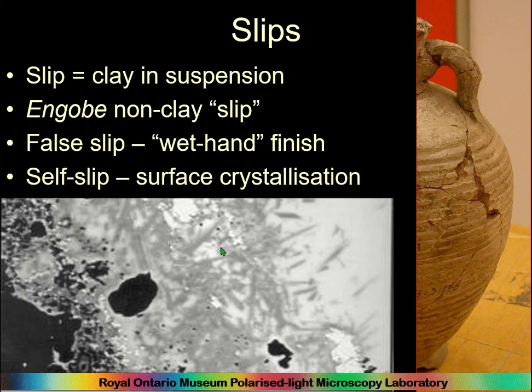And this is an interesting thing. This is an SEM picture. This is the clay body on this side, and this is glaze. And these are crystals of wollastonite, which is a calcium silicate. So it's possible that the grey ones here create a white slip on this pottery. It looks like, because this is a red firing pottery which is white on the surface because of the wollastonite crystals, which probably started off as being some sort of self-slip thing going on.